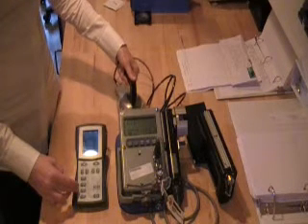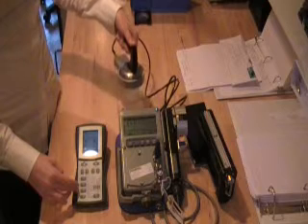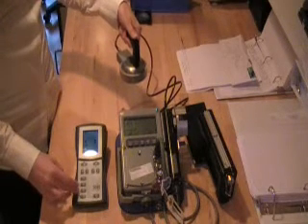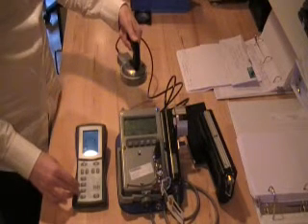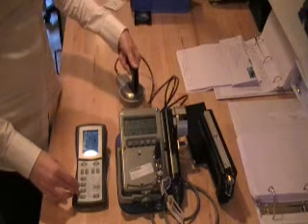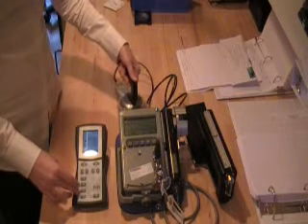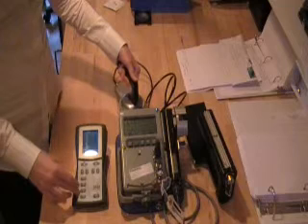Now, as the student backs the probe up away from that surface contamination, we have an automatic algorithm that's set to emulate strontium so that we would decrease our counts per minute for strontium at about 5 inches away from the surface, down to almost background levels. But as the student moves closer into the surface, you can see that the meter will respond accordingly, increasing the count rate until I'm almost at contact. That will give me my maximum count rate.